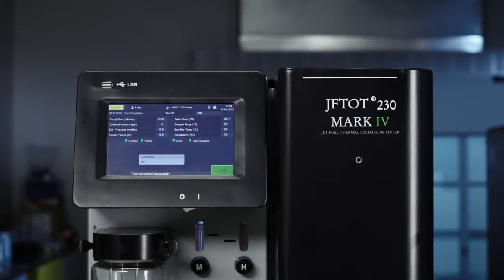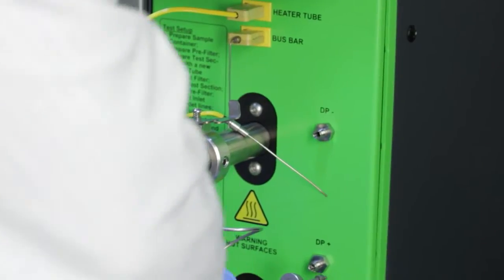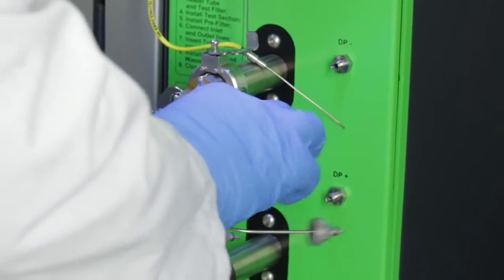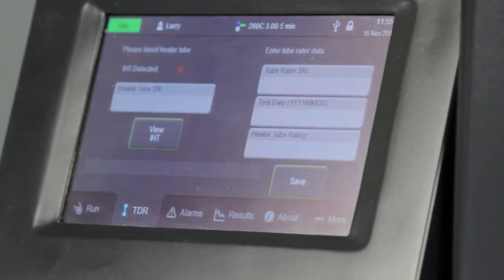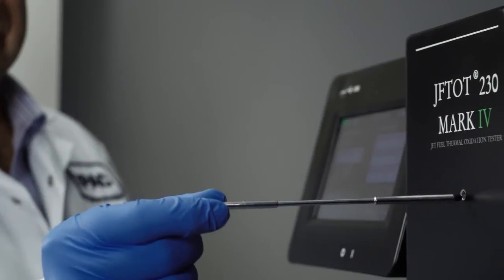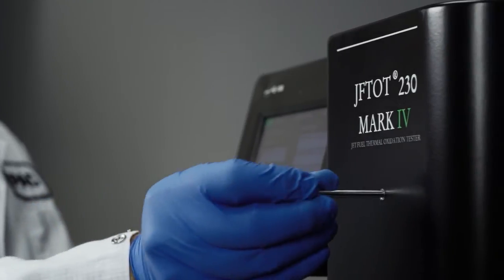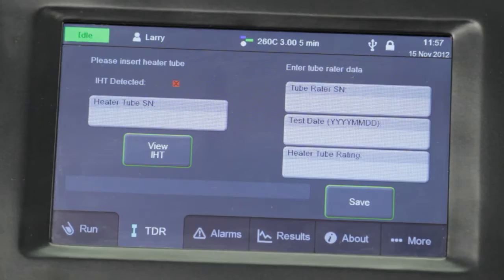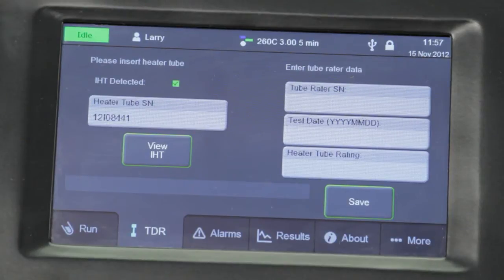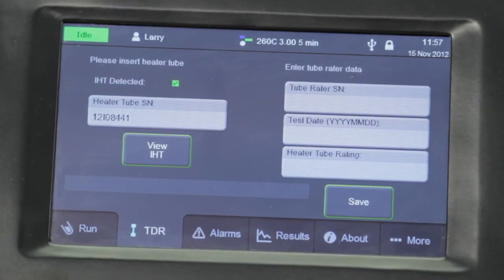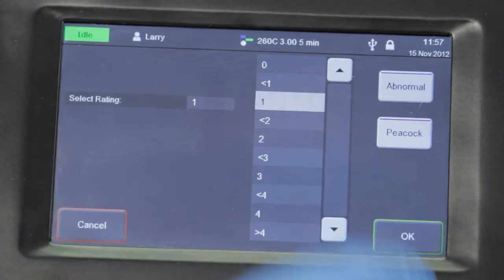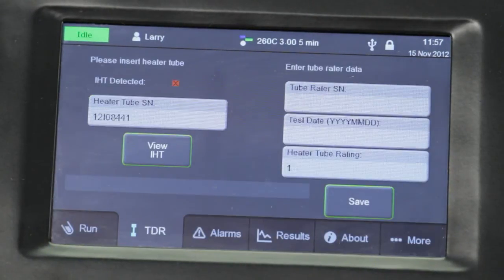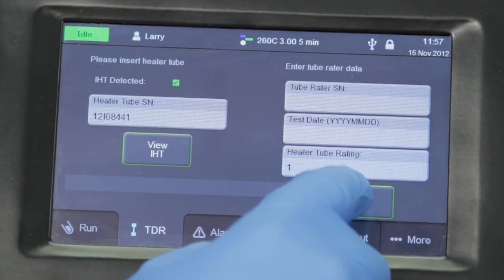When the test is done, you can rate the heater tube. Let the heater tube section cool and then remove the heater tube and rate the deposit as specified by the standard you use. Next, go to the TDR tab. If you used an intelligent heater tube like this one, insert the IHT into the reader slot located at the top of the instrument. The IHT serial number will automatically populate in the serial number field. Select the tube rating from the drop-down menu. Press OK and then press the Save button to save the data onto the IHT and into the filed database on the instrument.